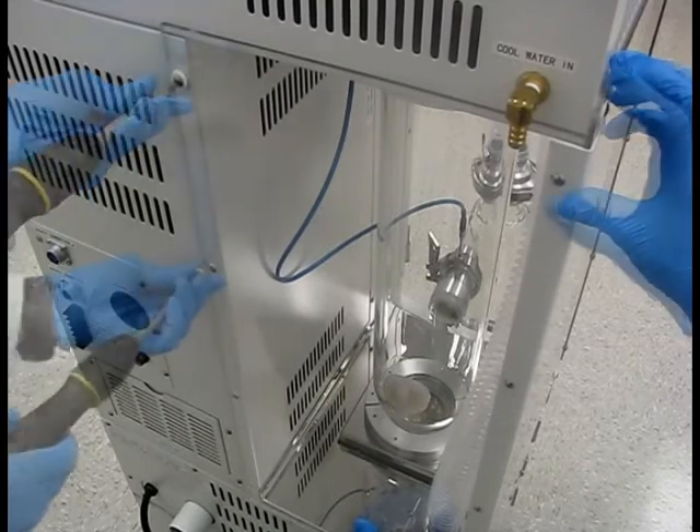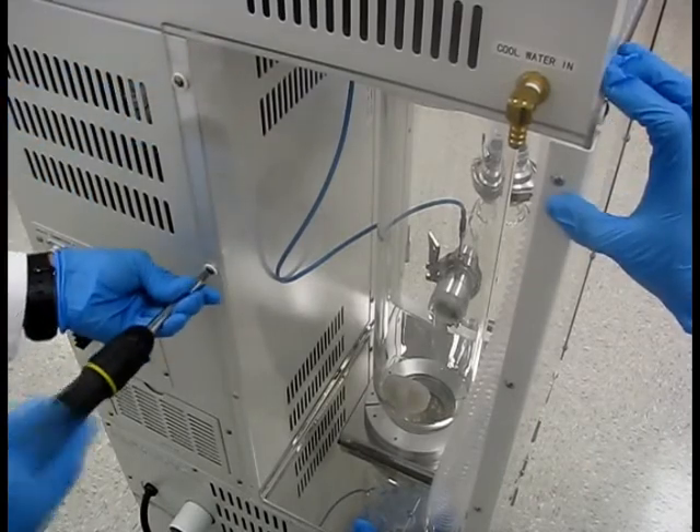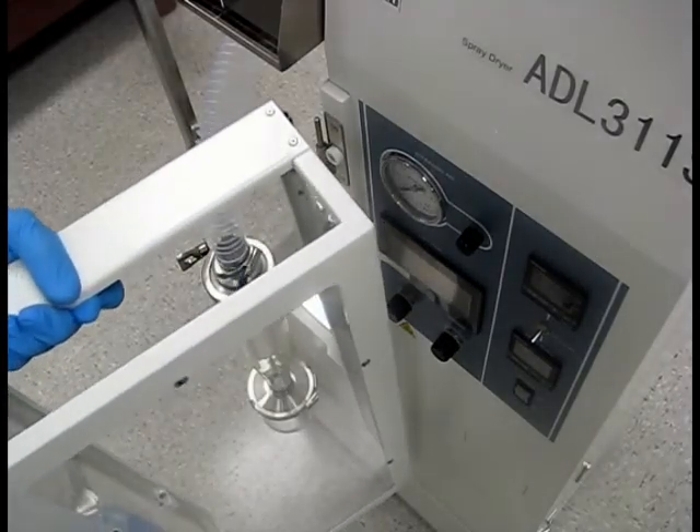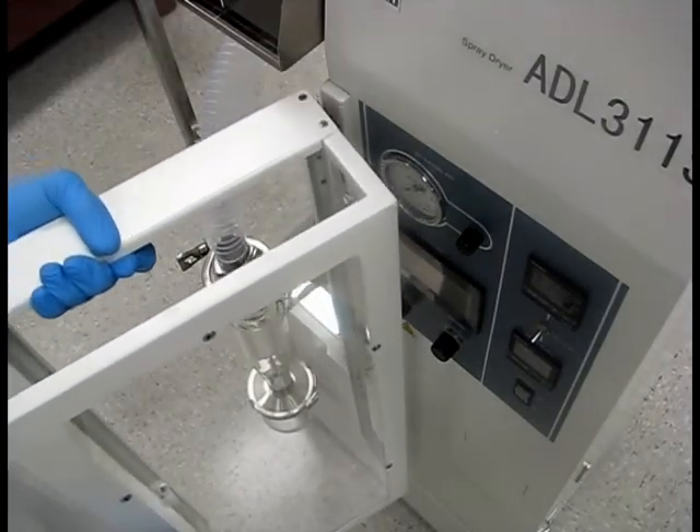Join the two panels together by installing screws into the corner bracket. Lastly, attach the safety cover door to the front of the machine by sliding it onto its hinges.